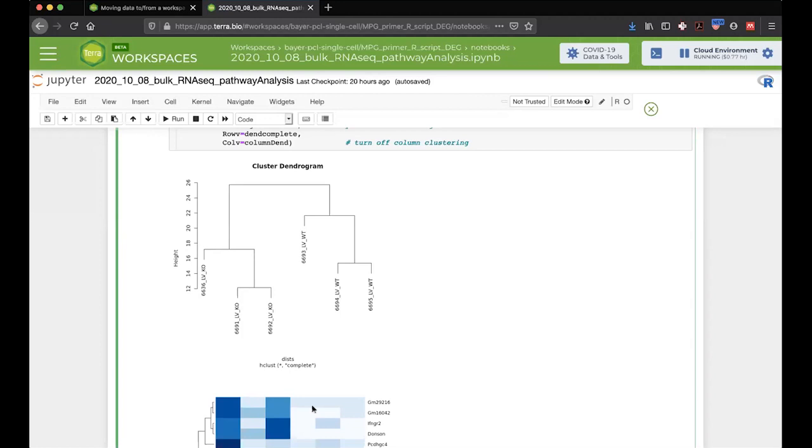But yeah, I would say either leave one out, PCA, check the dendrogram, and some combination of those should lead you to any massive outliers that are by sample. This also applies to any batching condition, right? If you ran something on one sequencing platform versus another, or did one library prep method versus another library prep method, if you've got that documented, any of those methods will help you isolate the sources of variation in your experiments. That's a great question.